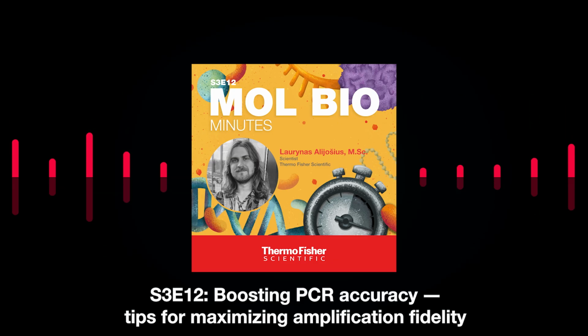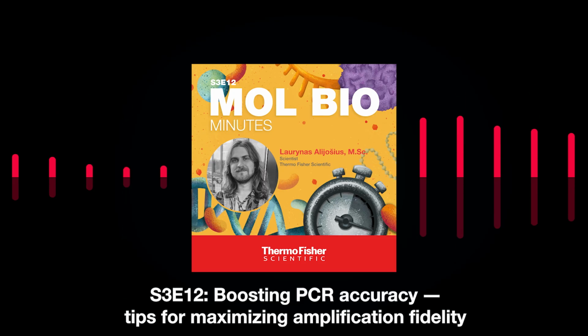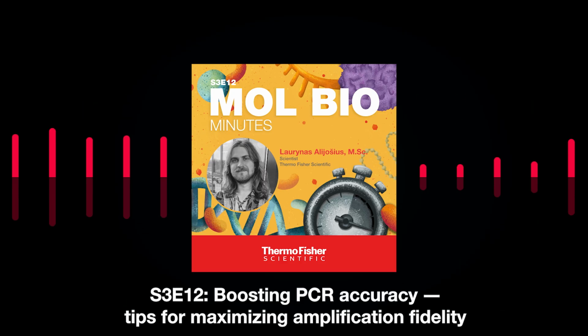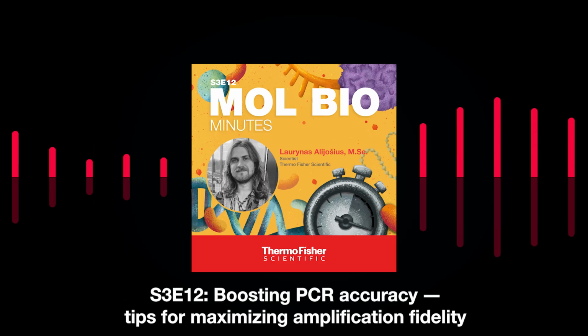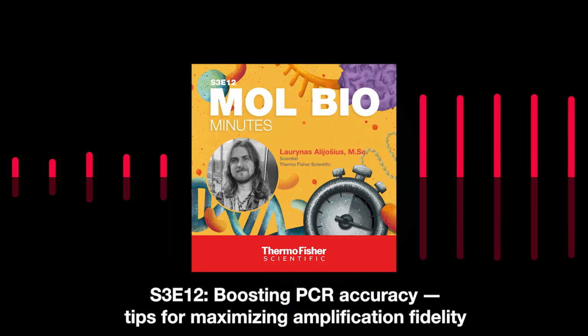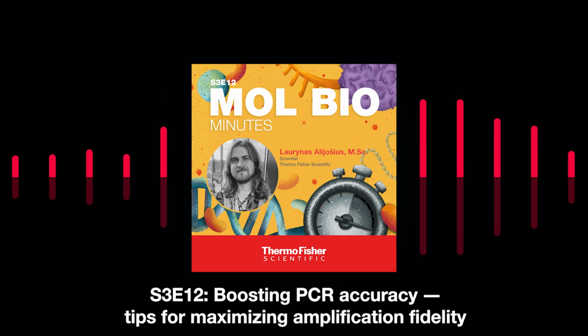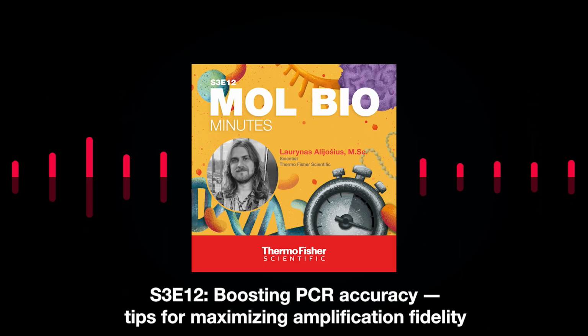Let's go back to the PCR components. So what about the other components? If we're talking about other components rather than the DNA polymerase, we want to have the highest quality possible for the highest PCR accuracy. Always follow guidelines such as primer design recommendations to have the best primers for your PCR. And for that, you can use our resources pages, or you can follow the manuals of polymerases or the PCR kits. Also, for a DNA template, you could use a purified DNA template when possible.